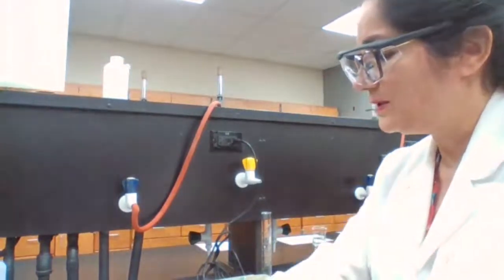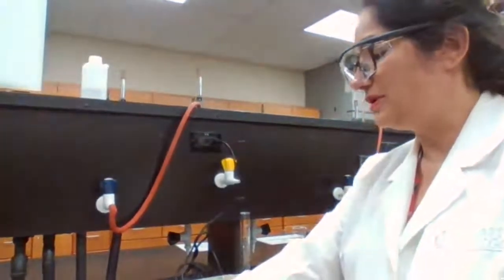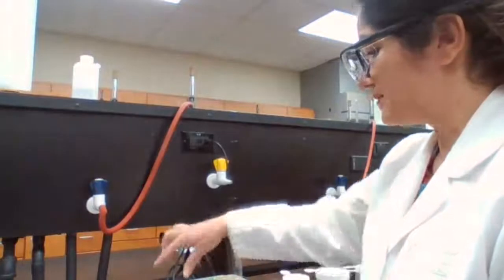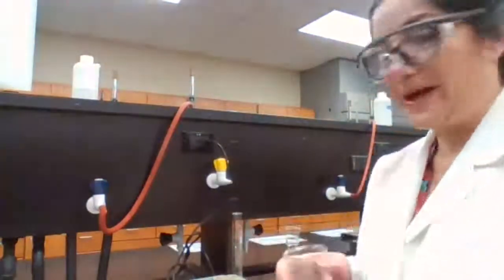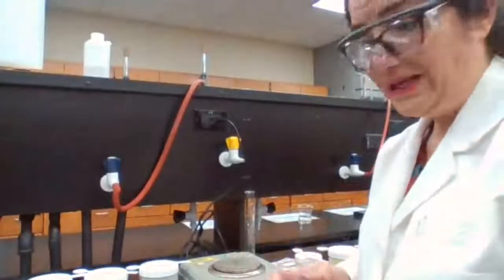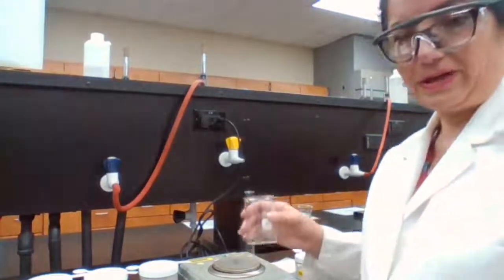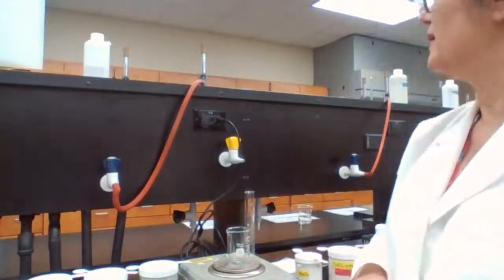We want to measure 22 grams of water, exactly 22 grams of water. So what should I do in order to measure 22 grams of water? First of all, I have to use a container. I cannot pour water on the balance pan. Definitely, that would be even silly to talk about. So we don't want to put any chemicals directly on the balance. So what we do, we just place a clean, dry beaker.